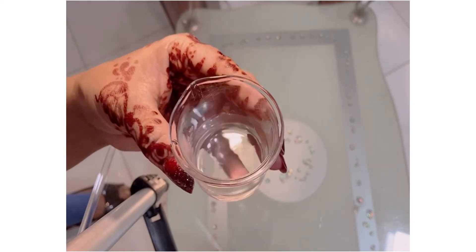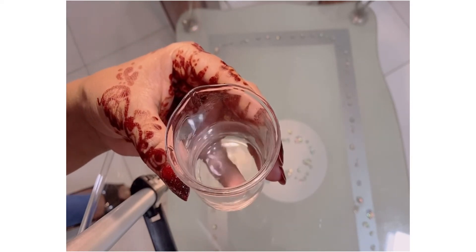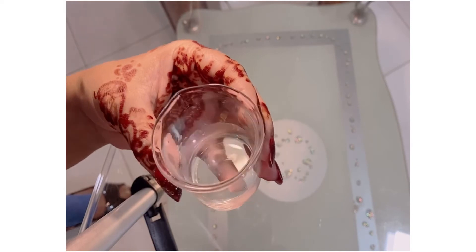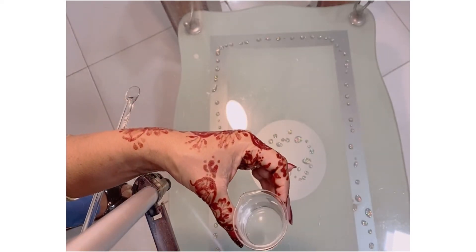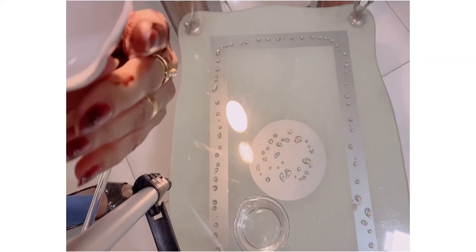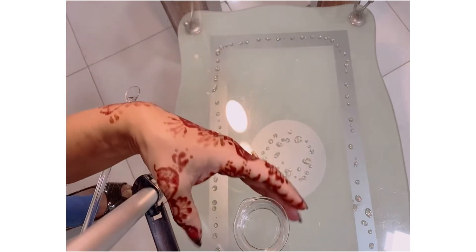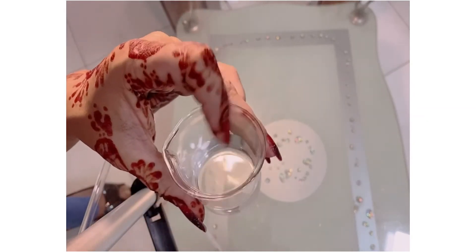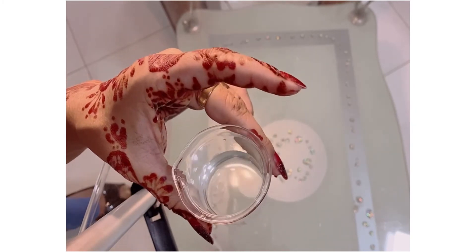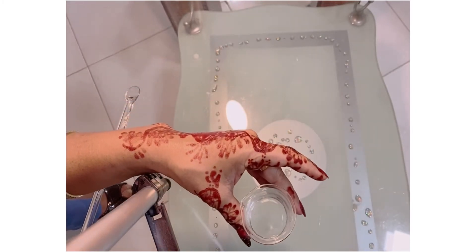Or if any other round flasks or conical flasks - what will happen in that case is that some portion of the solvent to be evaporated will get back, they will get the chance to escape and return or condense back into the same container, right?